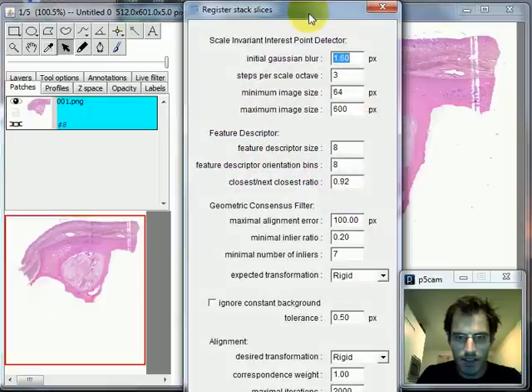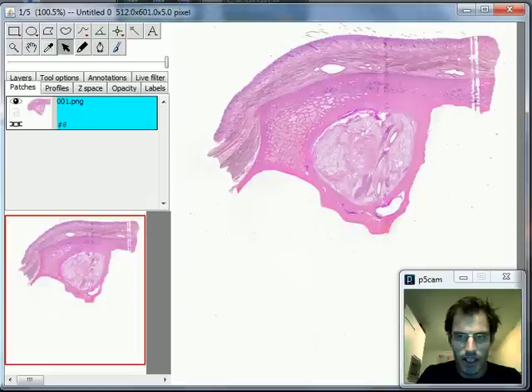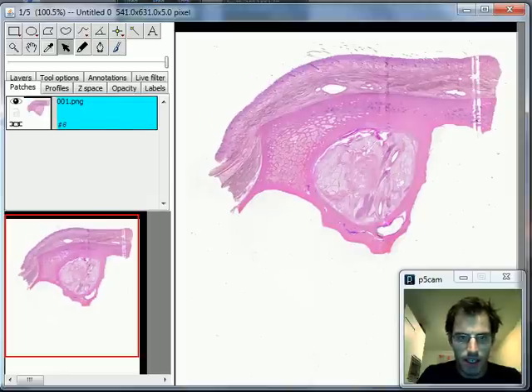I get this huge dialog. And in this case I'm not going to adjust anything. I just pick the default and click on OK. So it starts crunching. And it's done. That was it.